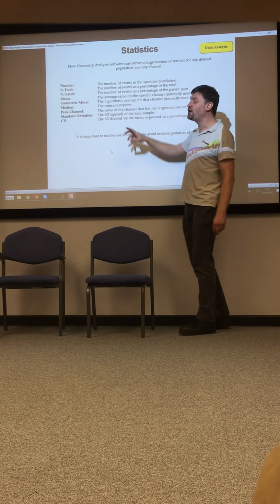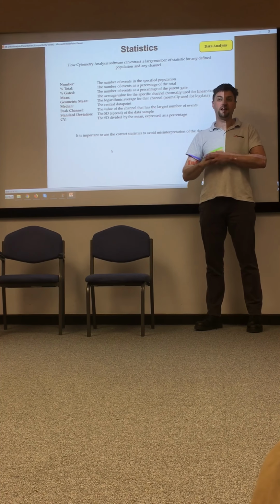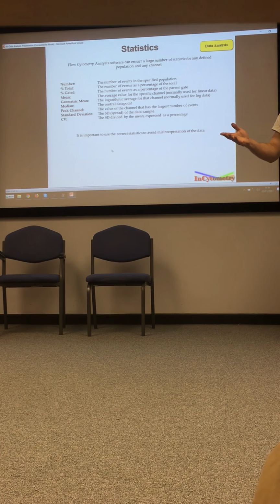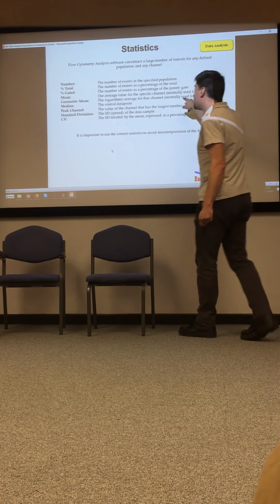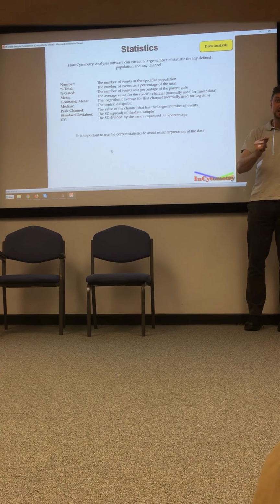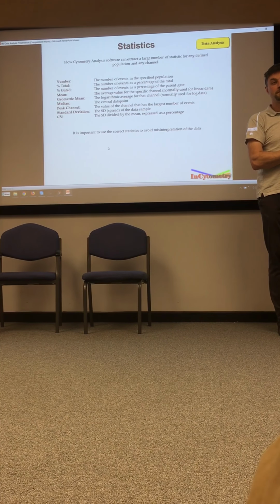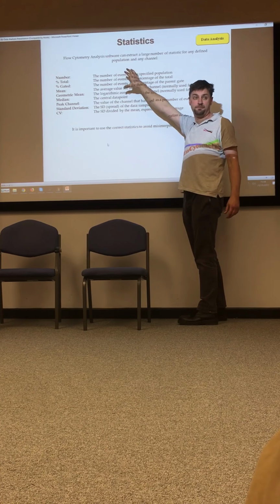So go away and reanalyze it and say, okay, right, fine. Of my lymphocytes, my T cells are now 40%, and last week they were 30%. Have I done well? Come on, you know the answer by now. Anyone? Word begins with a D? Don't know. Don't know, depends, yeah, exactly. Don't know. Because what if I've had a B cell depletion? My T cell percentage will go up, but I might have less actual T cells. Okay? So these numbers have got to be used with care.